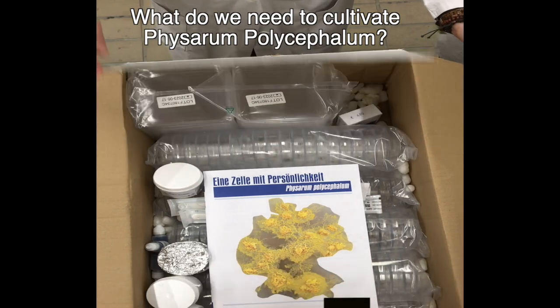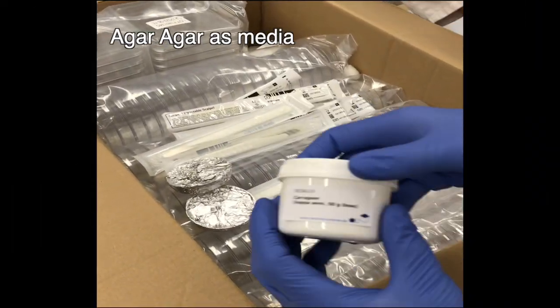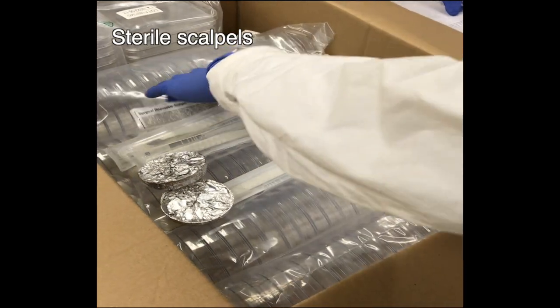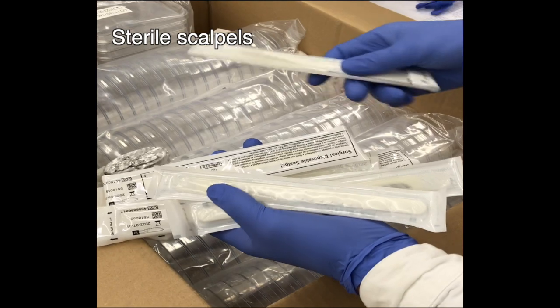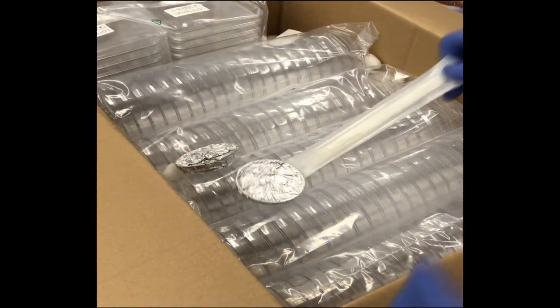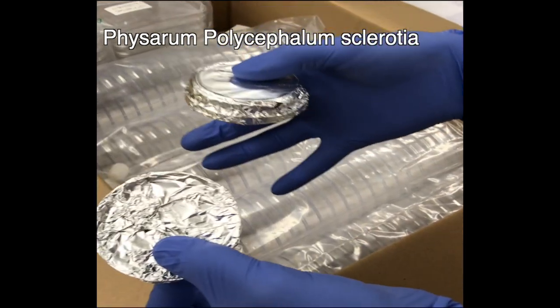To cultivate P. polycephalum, we need: Agar-Agar as media, stereoscalpels, sclerotia of P. polycephalum, and petri dishes.